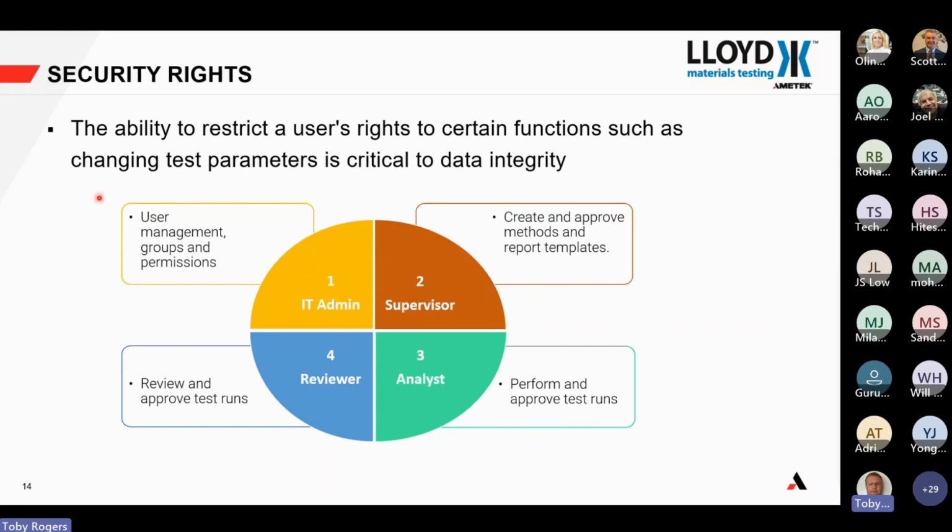But from a high level, what we have is a group who are managing users, adding, removing users to the system, modifying their permissions. This is managed by IT. And if we manage it by IT, then we're following your organization's policies. And as we discussed near the beginning on 21 CFR Part 11, compliance is a combination of the software plus your organization's IT processes. This is a key one to separate those features.